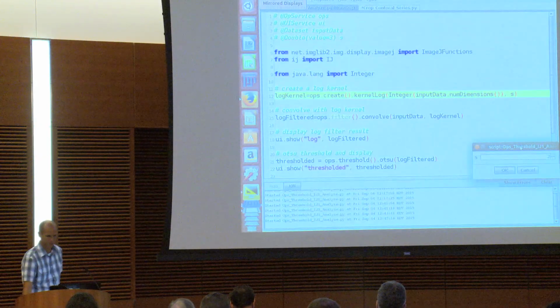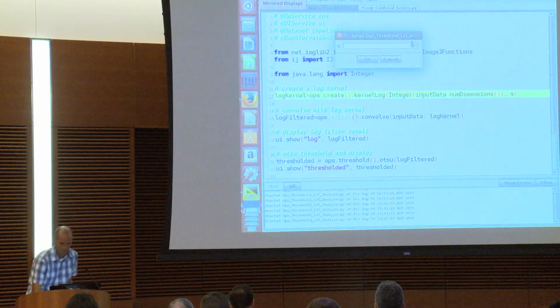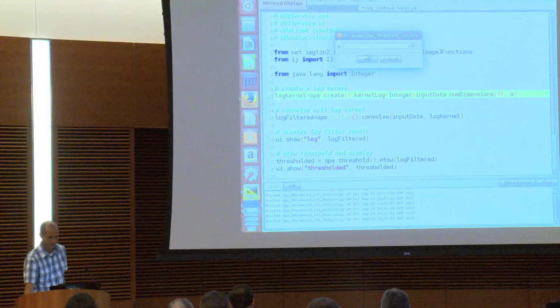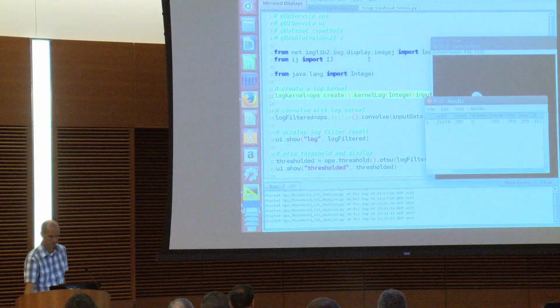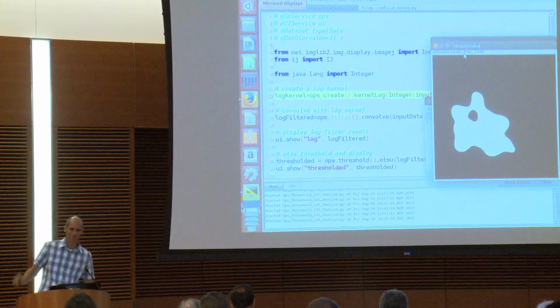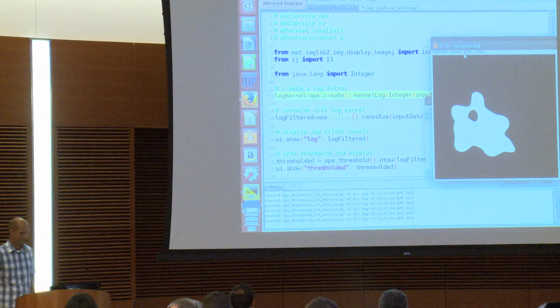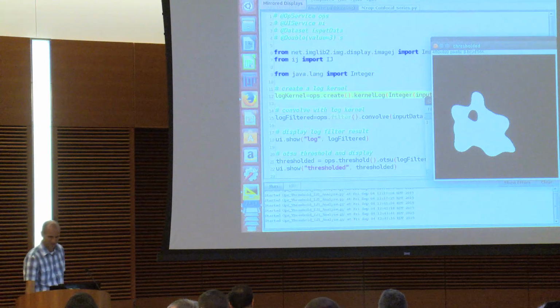Oh, so we have our thing. We have our S, and I'll make our S super big. He ran it before, and it remembered the two. Yeah, I remembered the two. If you don't want that, you say persist equals false in the params, and then it would always start at 3.